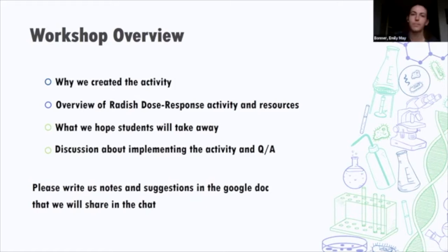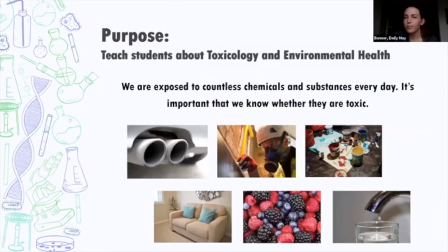So hopefully we can get you excited about it, and you can ask any questions that you have during the workshop. Okay, so when we decided to choose the Radish seed activity, our larger purpose was to teach students about toxicology and environmental health, which are largely the focuses that Yvonne and I have in our program.